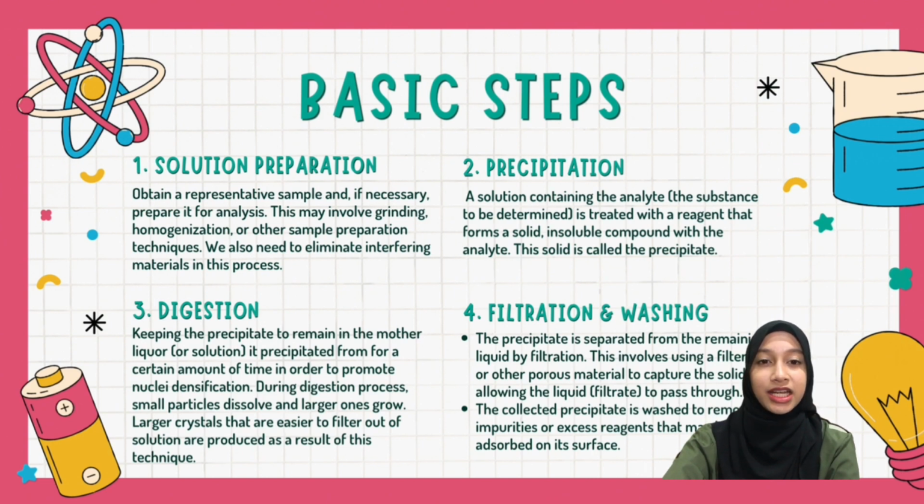Second, precipitation. A solution containing the analyte, which is the substance to be determined, is treated with a reagent that forms a solid, insoluble compound with the analyte. This solid is called the precipitate.